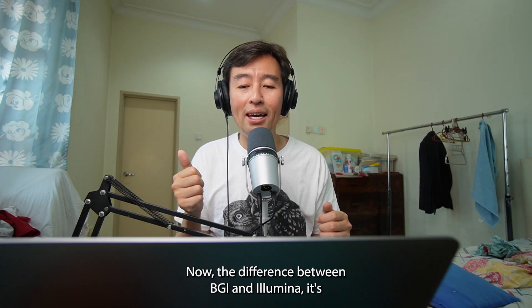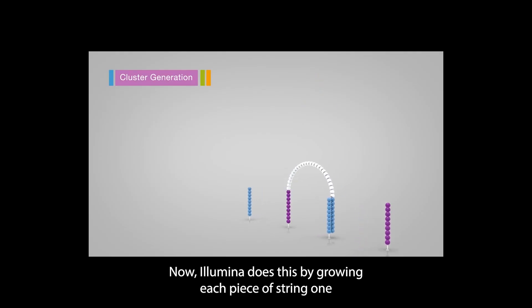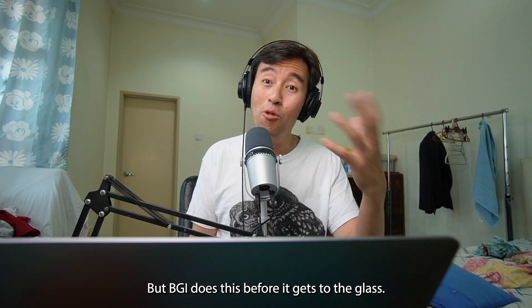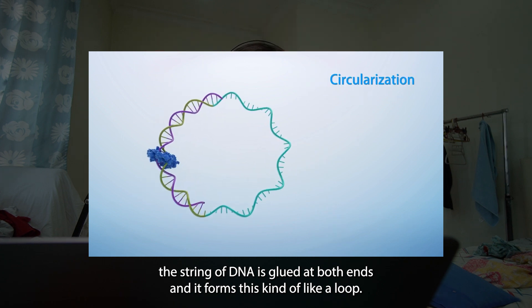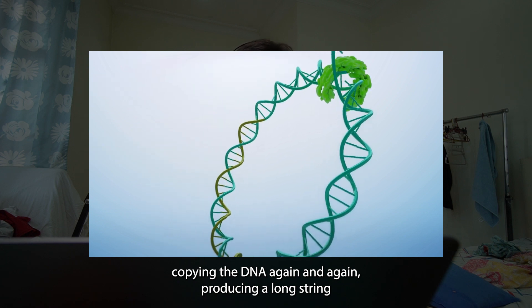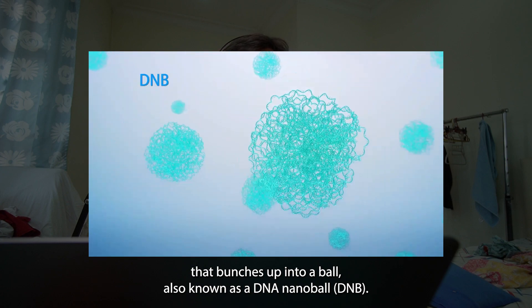The difference between BGI and Illumina is how they multiply these pieces of DNA strings. Illumina does this by growing each piece of string one by one on that piece of glass — from one piece of DNA you end up with many copies, producing many dots on your photograph. But BGI does this before it gets to the glass: the string of DNA is glued at both ends, forming a loop, and a replicator goes round and round the loop, copying the DNA again and again, producing a long string that bunches up into a ball — also known as a DNA nanoball.